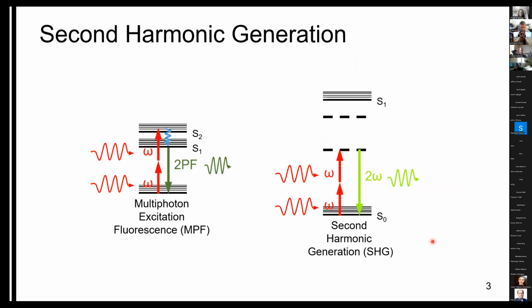So first, I would like to review the concept of second harmonic generation, or SHG. SHG is a nonlinear optical process similar to frequency doubling in electronics, which occurs efficiently in a thin section of collagen in a microscope when an ultrafast pulsed laser interacts with matter to produce light that is one half the wavelength, or twice the frequency, of the laser.